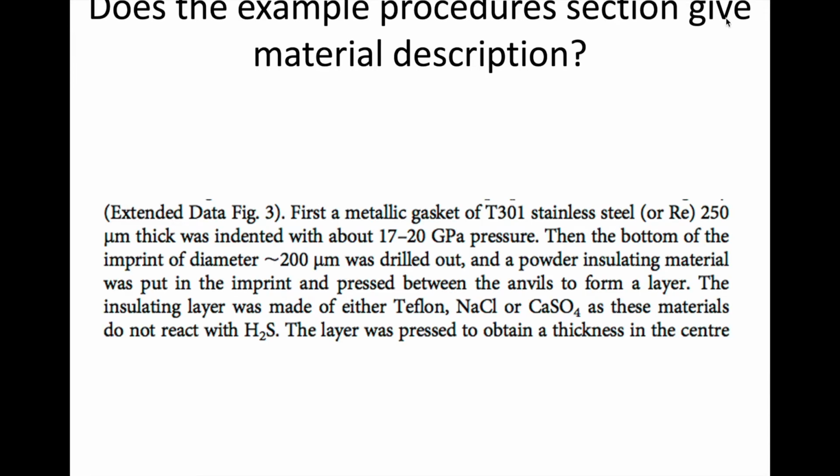The next thing I'm looking for is, well, there was equipment, so now also the materials that are used. I want to know what materials we use. This is a materials lab, so there are obviously going to be some materials. Again, I highlighted a section from that experimental procedure. It talks about a metal gasket, and it tells you what the alloy is, the thickness, and the pressure that it's used at. It tells you a lot of information.